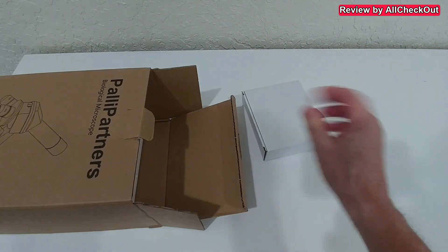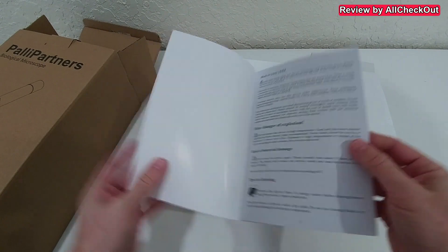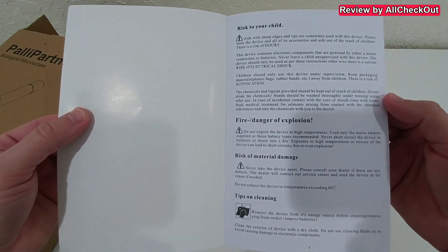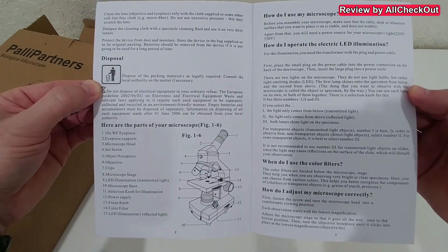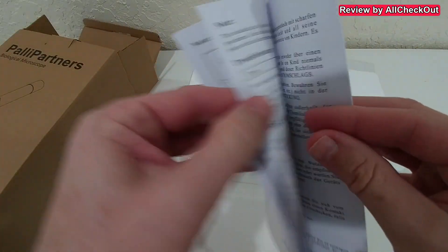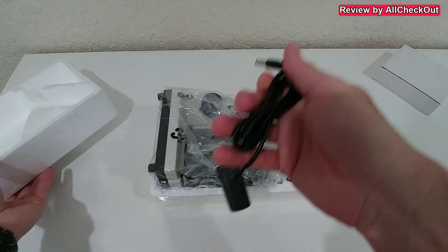Here's the box — let's open it and see. Here's something already, and the main box is nicely protected. Here are some detailed instructions — the manual comes in different languages: German here in the back and some English in the front. It's just about five pages, not too much. We have to cut it open to get started.